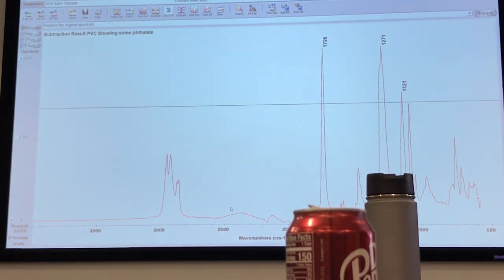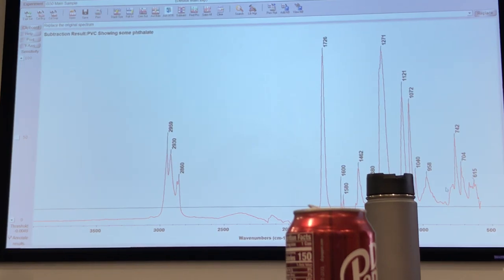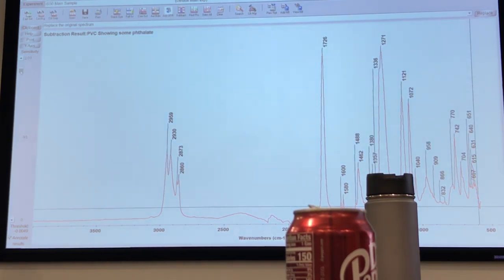You can also improve the sensitivity. Like if you really want these shoulders to be picked up, you can also increase the sensitivity of how it is picking the peak. So I can just increase the sensitivity and then it keeps picking a lot, so it will even pick the tiniest peak. So this is just for reporting function. So if you want to report, it's nice, and you can just save it like that.